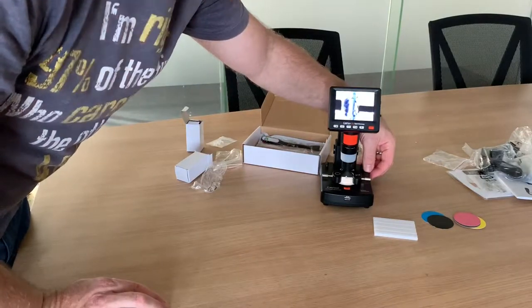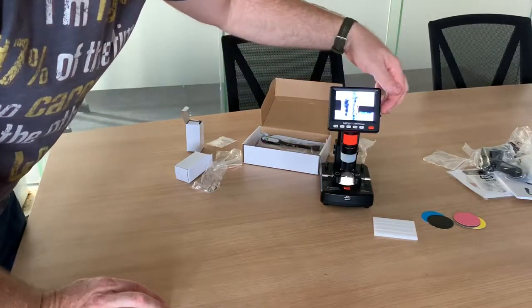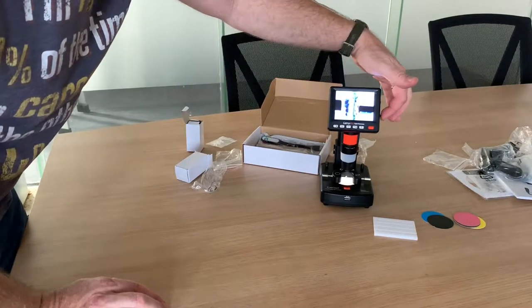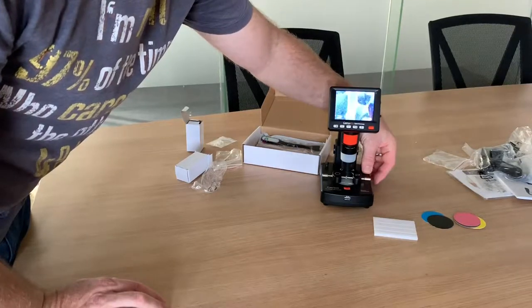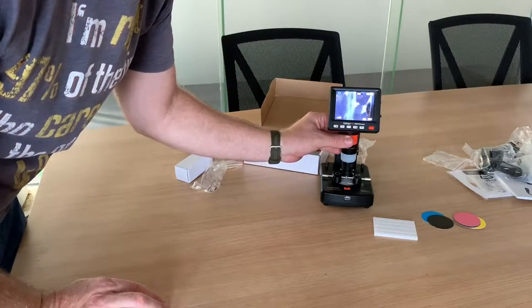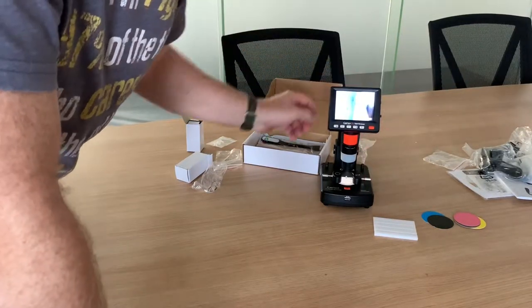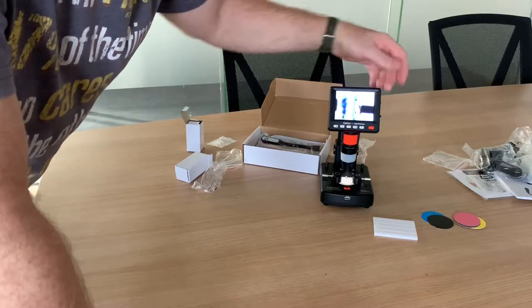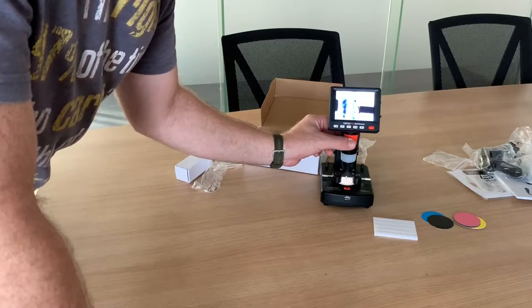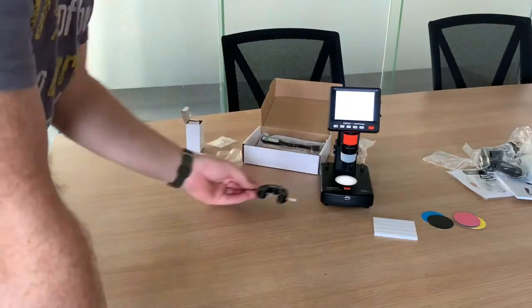If you want to put some light on it, down on the bottom right you can bring up some light. You've also got your four-time zoom so you can go right in on that. If there's too much light in the background you can bring it down. When you're zoomed in close you can focus a bit more. You can bring it right in and read the inscription like that.